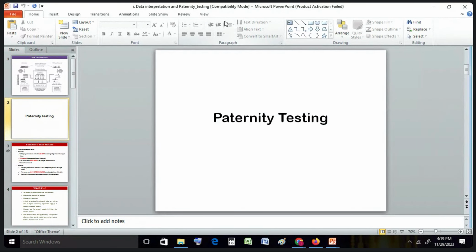Is it possible? স্যার এটা তো পসিবল স্যার। এখন এসটিআর ওই বাচ্চার যে এসটিআরটা আমরা বের করে স্যার 13 লোকাস, যদি আমরা স্যার পপুলেশন ডাটাবেজের সাথে, যদি আমাদের কোনো সাসপেক্ট থাকে তাহলে সাসপেক্টের সাথে করতে পারি, আর যদি সাসপেক্ট না থাকে তাহলে র্যান্ডমলি যে আমাদের পপুলেশন ডাটাবেজ আছে ওইটার সাথে স্যার আমরা যদি ম্যাচিং করি। Yeah, I do understand your point.